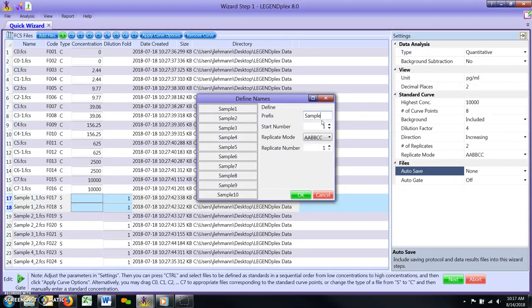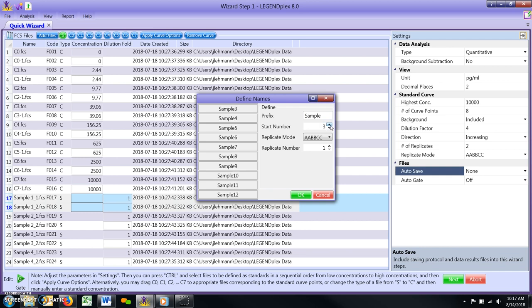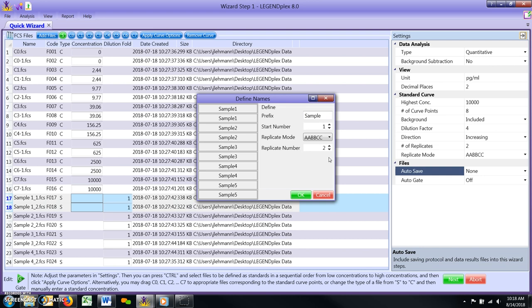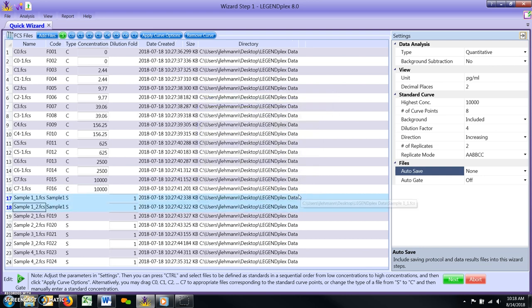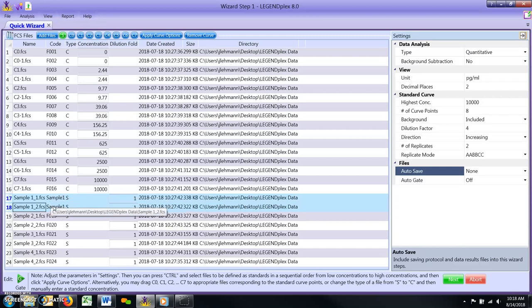Start Number. All replicate names are required by the software to have a number as well. The default start number is 1, but can be adjusted to other integer values by the user. Replicate Mode. This setting is the same as it was for the standard curve files. Replicate Number. Users should adjust this value to reflect the number of files in a given replicate, i.e. adjust this value to 2 if describing an unknown sample assayed in duplicate. Once you have defined all the appropriate settings, click on the green OK button to close the window. The replicate names that have just been assigned to your FCS files will now appear in the code column of the Quick Wizard File List to the immediate right of the file name.